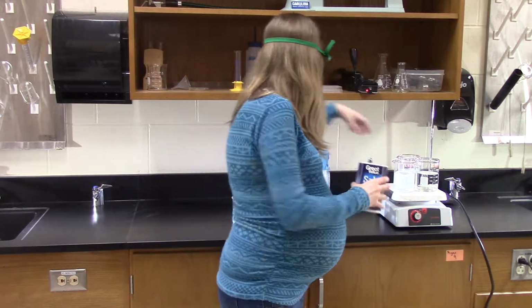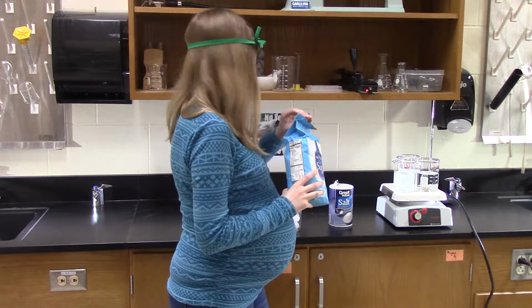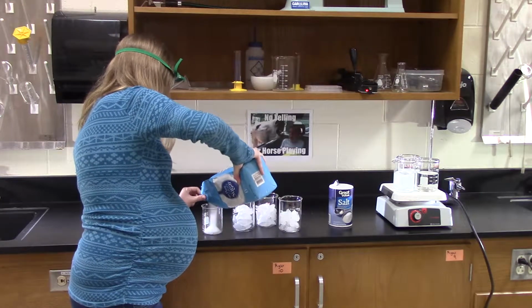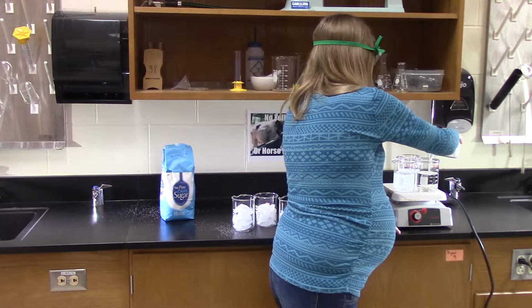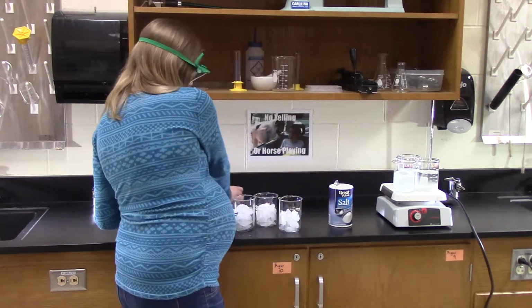And then the sugar one, we'll go ahead and pour some sugar in there. Again, I'm just kind of eyeballing it.